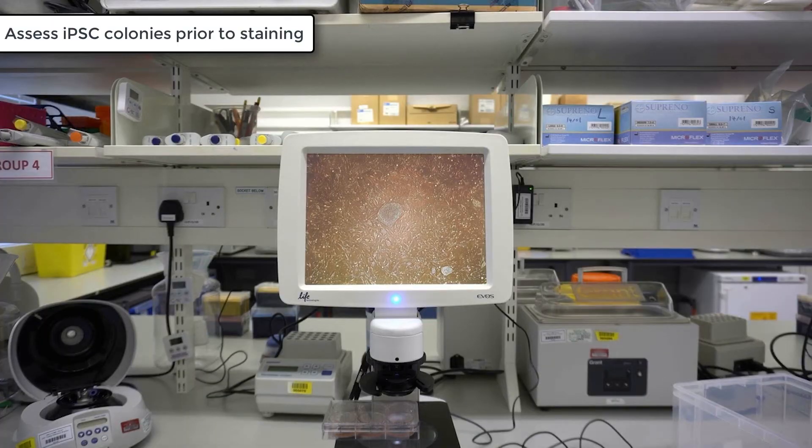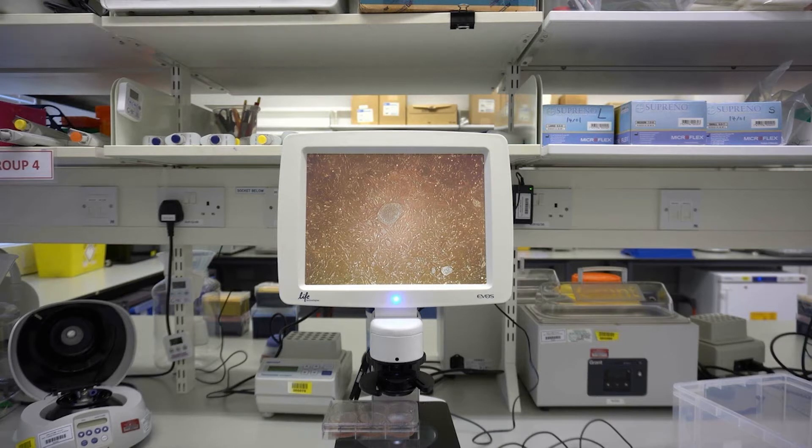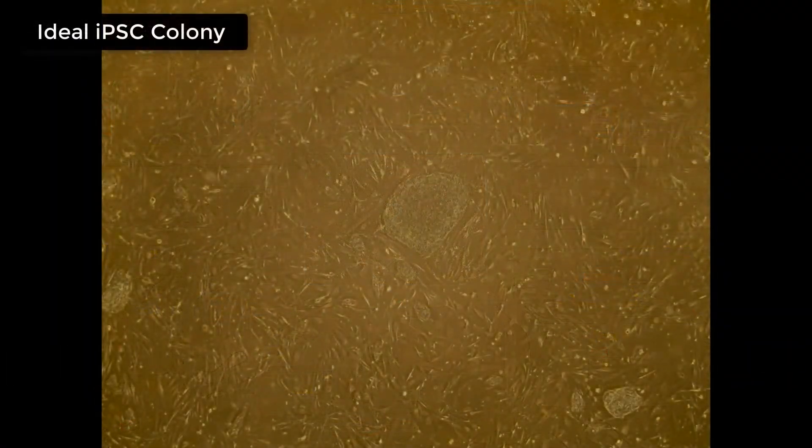Before you begin the antibody staining, check that you have some iPSC colonies present on your culture plate. Here we have an example of an ideal iPSC colony, which is reasonably big and round with smooth edges. This will be good for colony picking and for live staining.